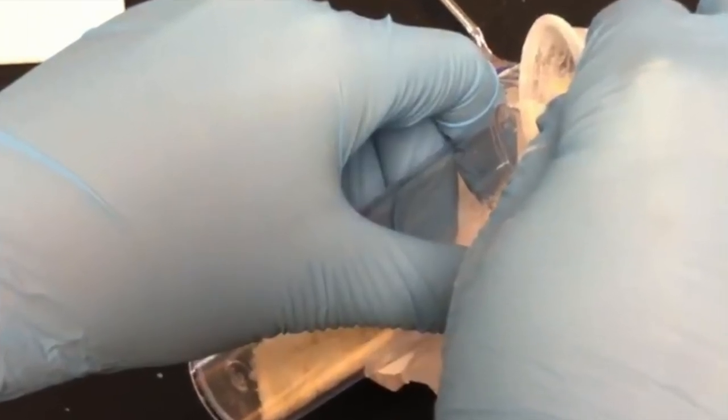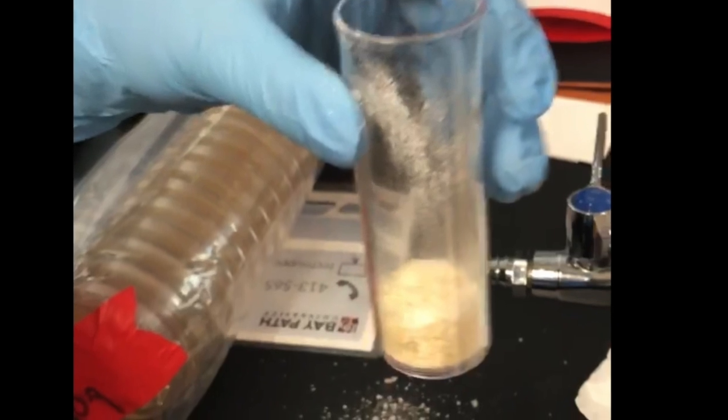Once all the flies were sexed, another test tube with new media was made.